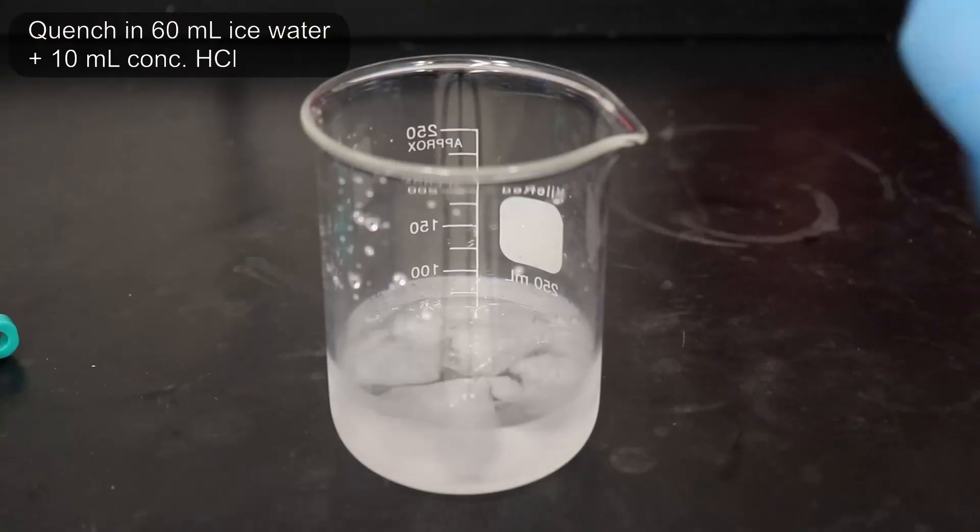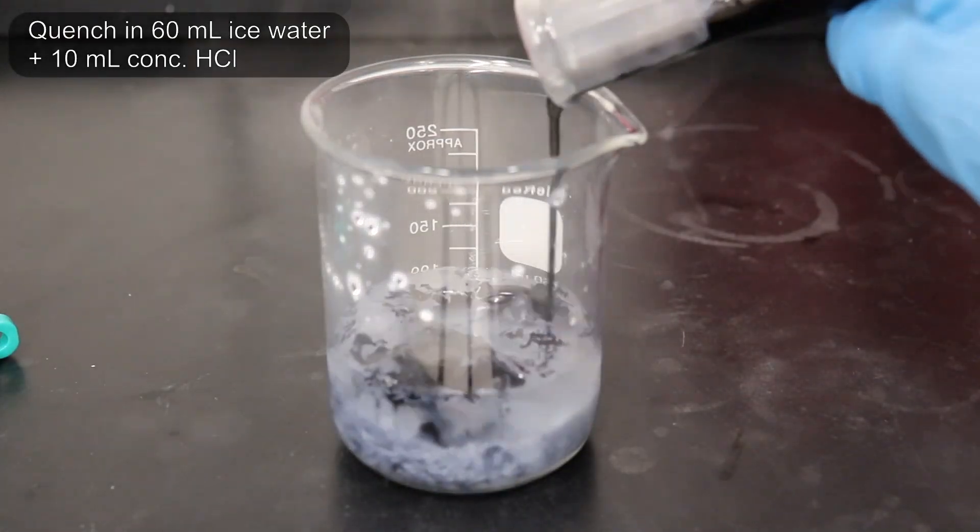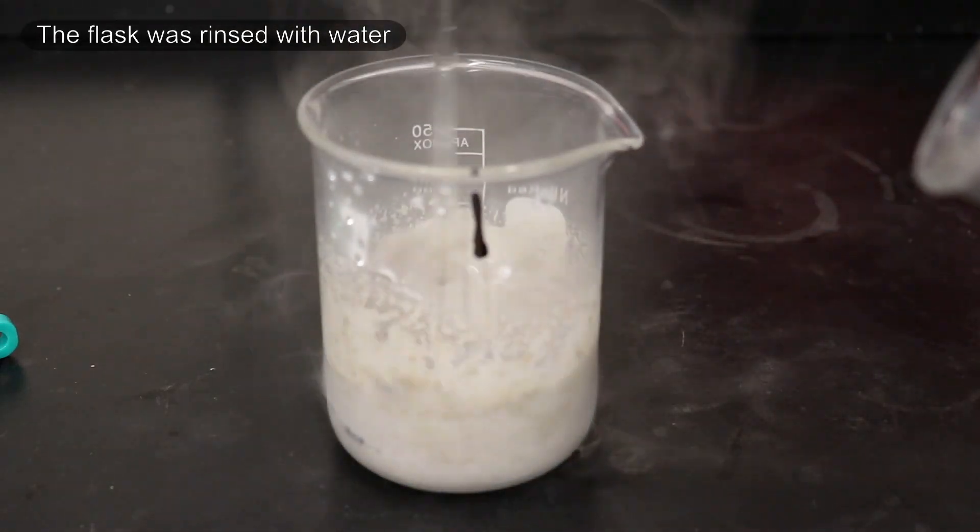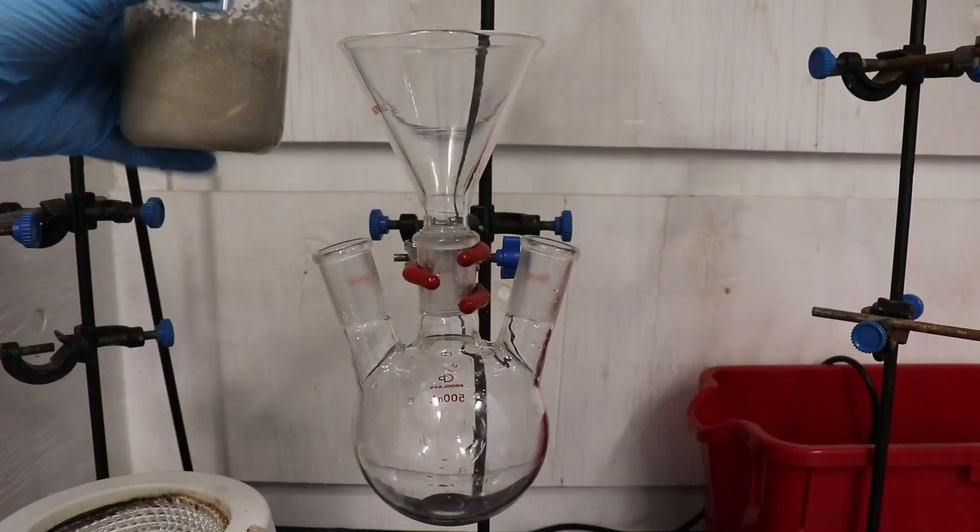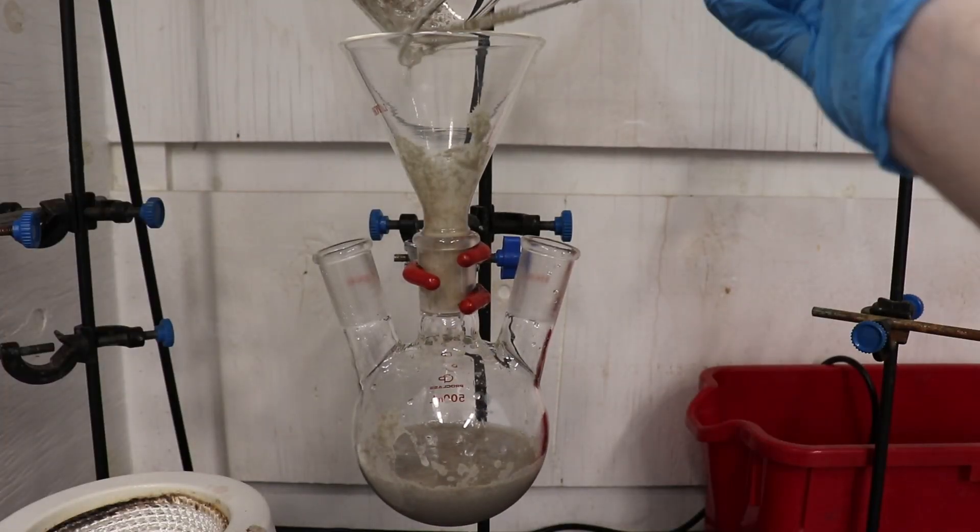The reaction mixture was then quenched by pouring it into a mixture of 60 grams of ice water with 10 milliliters of concentrated hydrochloric acid. And now I have to separate the product from the quenched reaction mixture.